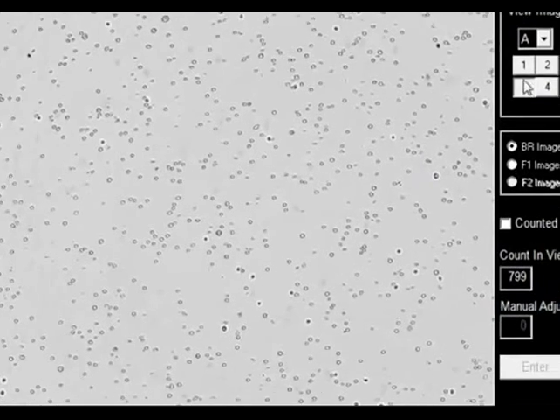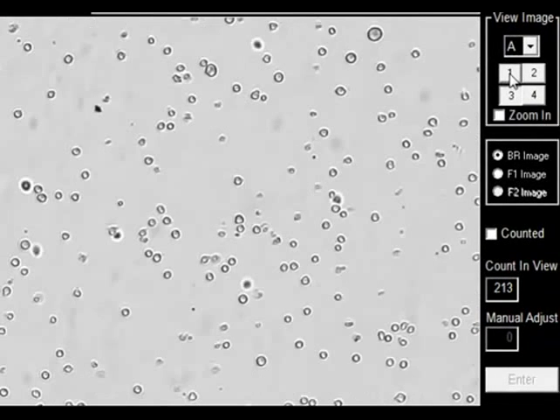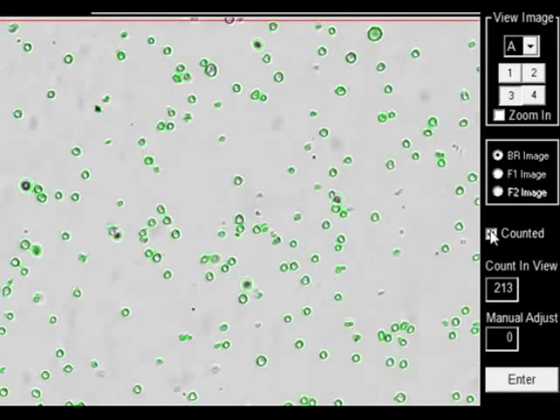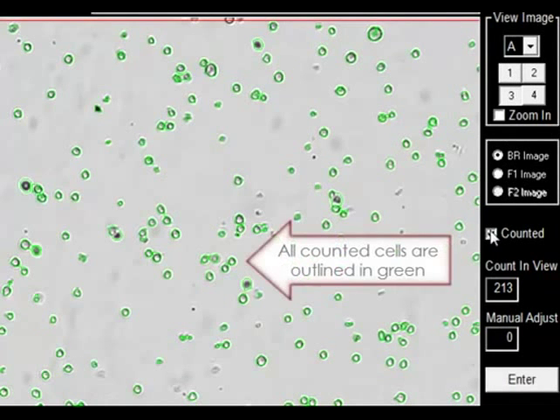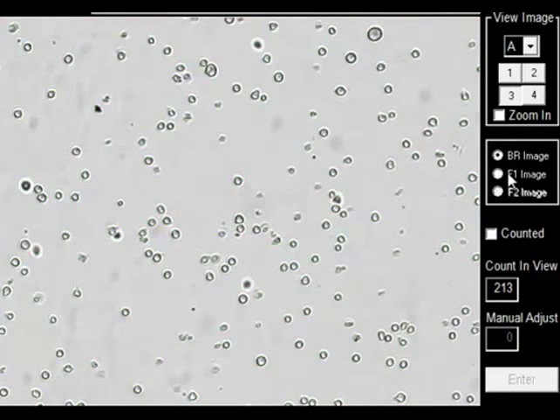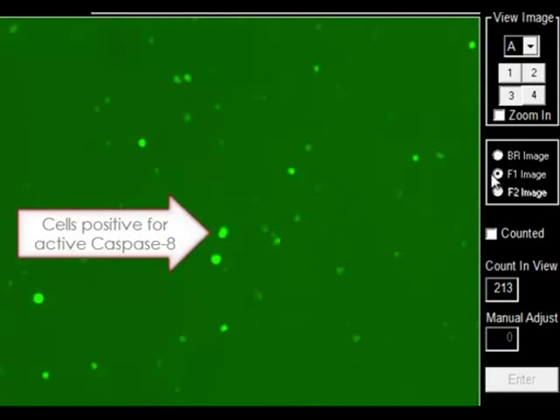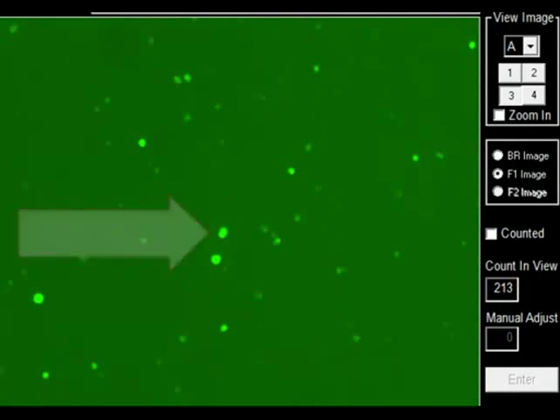Cell images can be viewed to check cell morphology and review counted cells. In the bright field counted image, all counted cells are outlined in green. The fluorescent image indicates cells positive for active caspase-8.